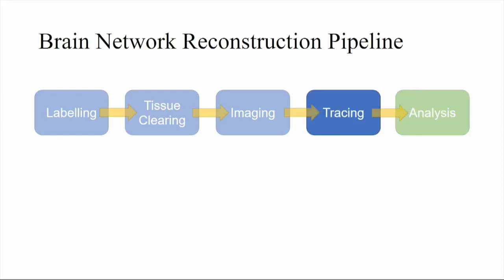If we look at the overall pipeline, most pieces of this, the blue boxes here, are either automatic or don't require a lot of manual human time besides the tracing. In their lab, they have postdocs, research scientists, and hired trained undergraduates who spend a significant portion of time just tracing on these image slices to even be able to do the analysis they're interested in. This can take maybe months for even just a few neurons.